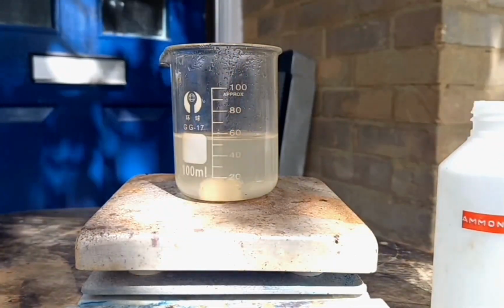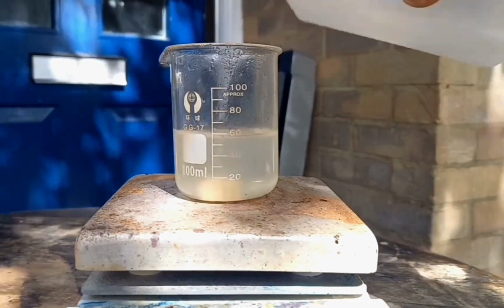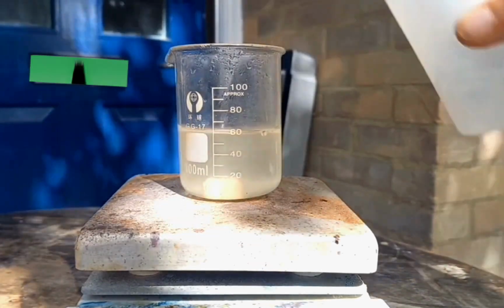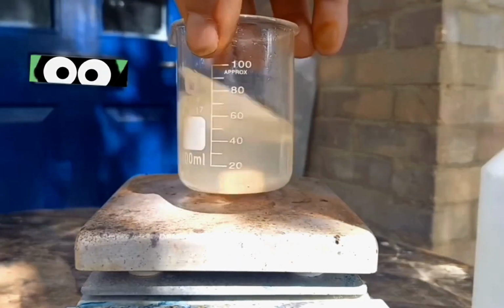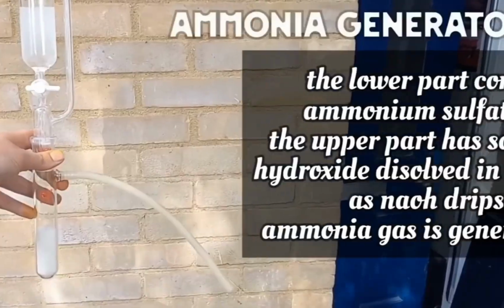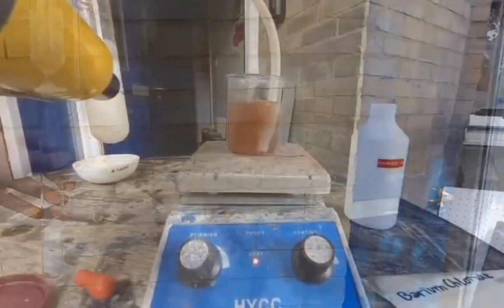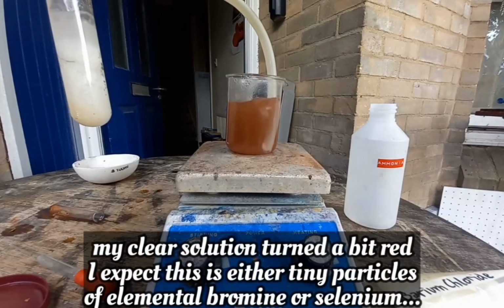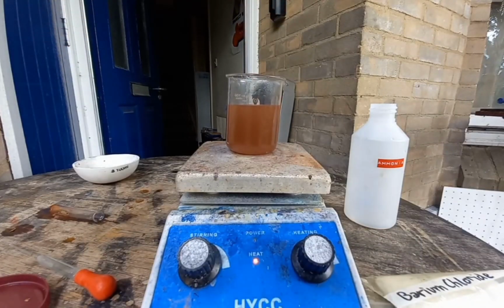Still very acidic. The colour has disappeared. I should hopefully neutralize the hydrogen bromide. You have to check the pH.